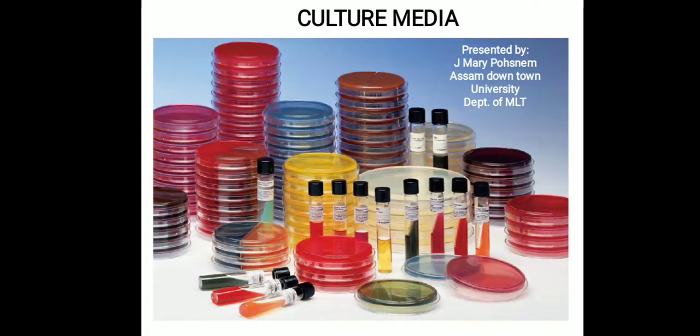Hello students, today we are going to discuss one of the practicals, that is the culture media. These culture media are required for the growth of microorganisms from infected material to identify the causative agent. The basic constituents of culture media include water, electrolytes, peptone, meat extract, blood or serum, and then agar.